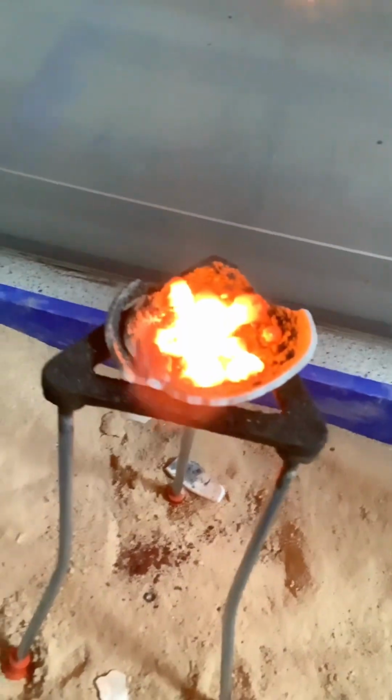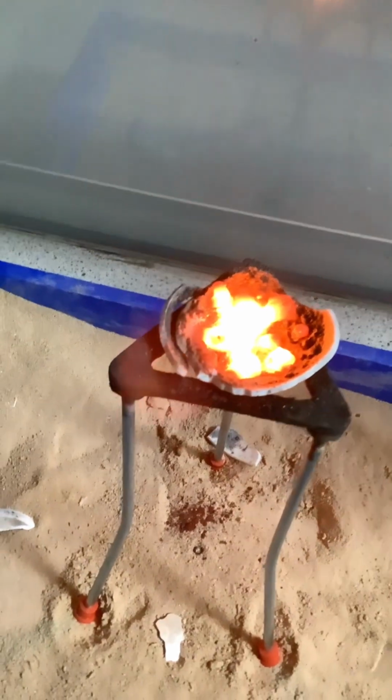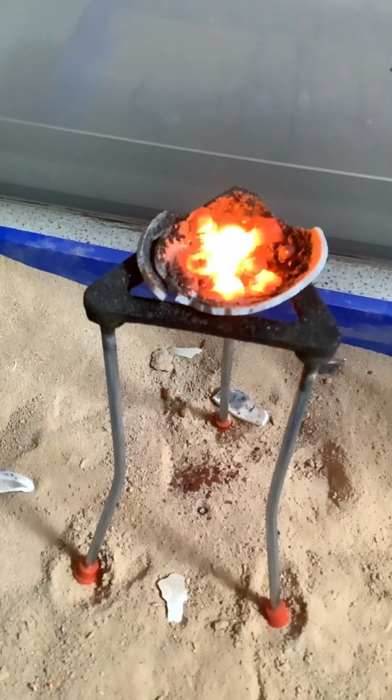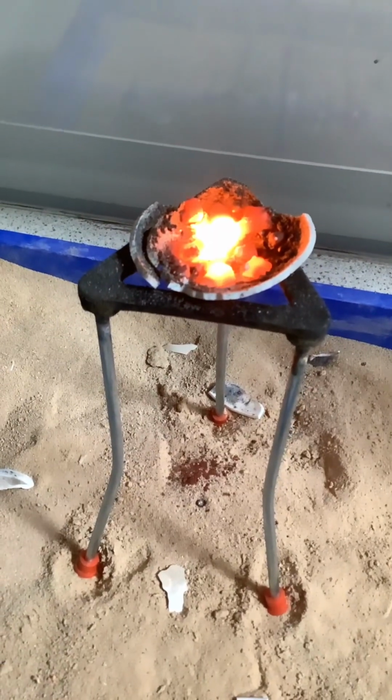It's a very vigorous experiment, and as you can see, the shining thing is pure iron. I can show it to you more clearly in here, this is an example of a very shiny iron mold. So now this is the way that you can create your own iron using the thermite experiment and observe the best.